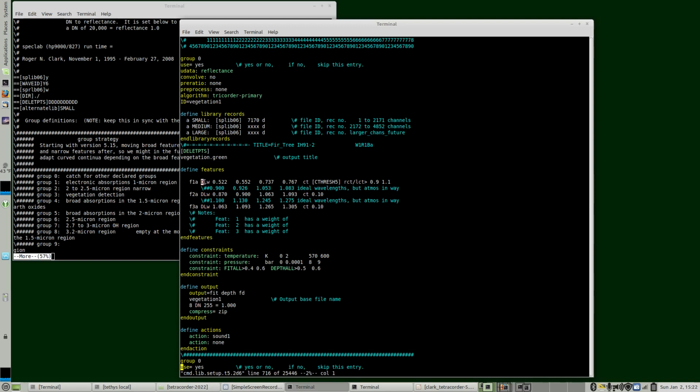Then we have what type of feature it is. D is for diagnostic. We also have optional and weak. Optional means that if it's present, and I better make sure, it's been a while, corporate history is fading. We'll go up to the top and define clearly what diagnostic, optional, and weak are. The L is for linear continuum. We can also do a curved continuum. And then the W here is for the following numbers are in wavelengths in microns.